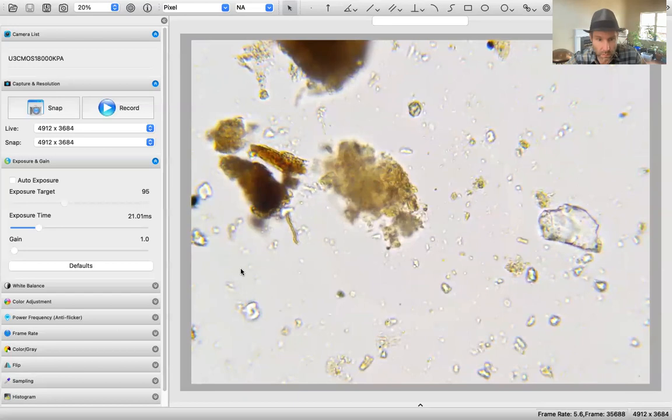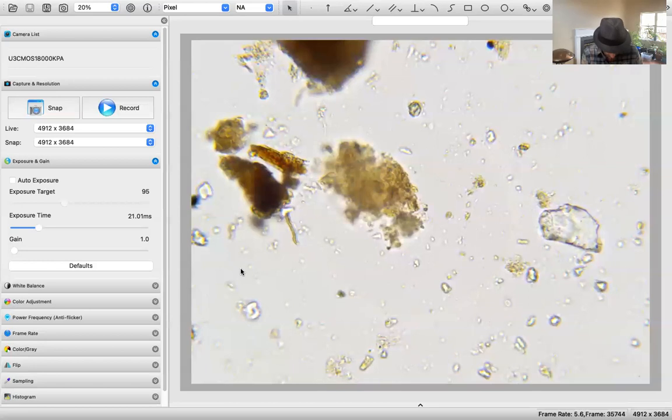Nothing in particular. Another NA, man. I'm sorry this isn't that interesting. I saw movement and got excited, but it was organic matter.